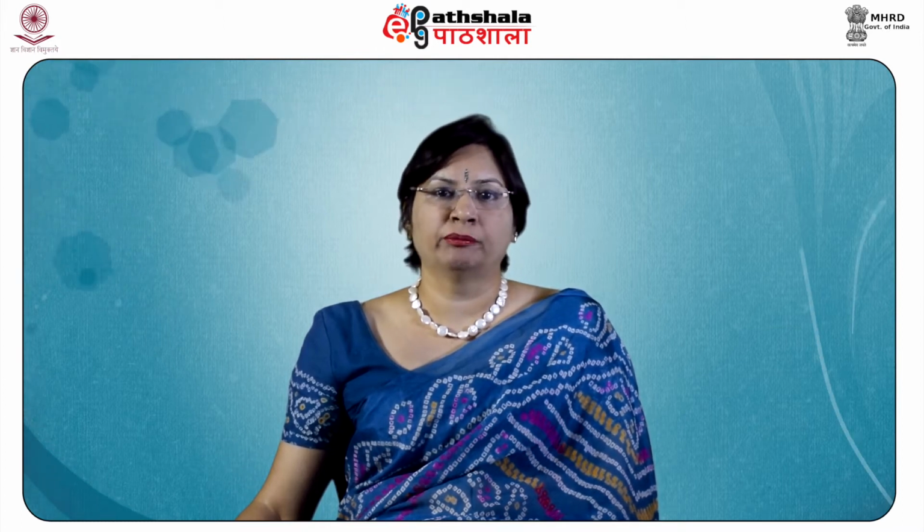After studying this module, dear students, you shall be able to know how to carry out the extraction and distillation of fire samples, because once you have collected them from there, how they will be further dealt with in the forensic science lab is what we will be studying here. Then how chromatography works, and we will be specially focusing on gas chromatography and capillary gas chromatography. We shall also understand the ideal conditions for the instrumental examination that you have to follow for conducting these examinations or handling these instruments.